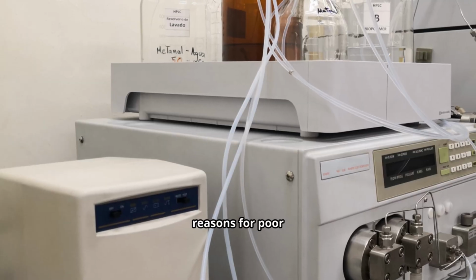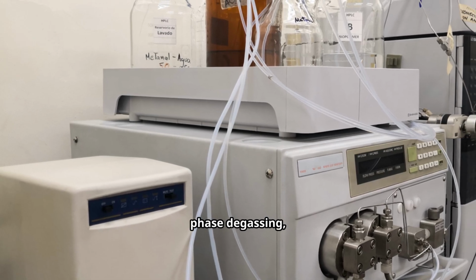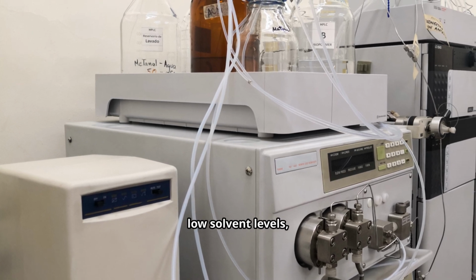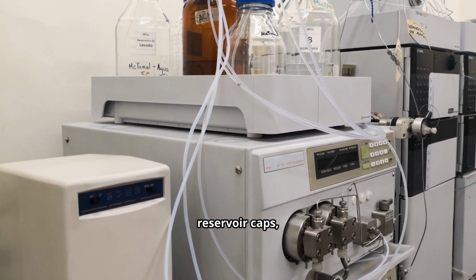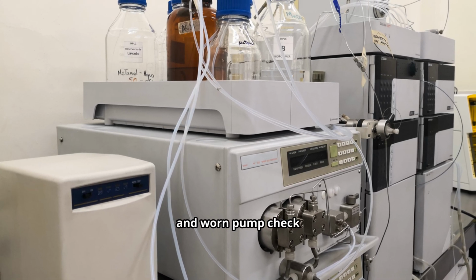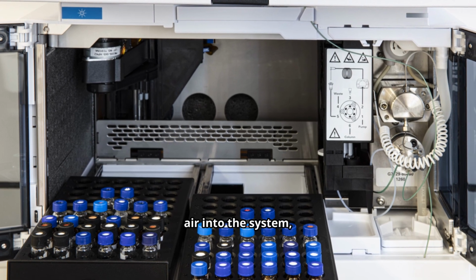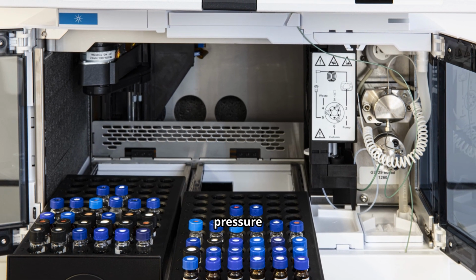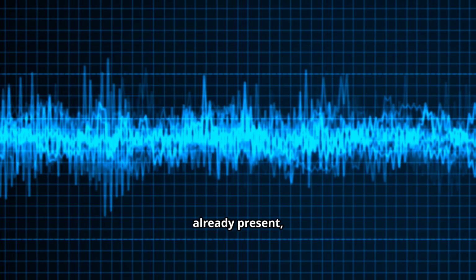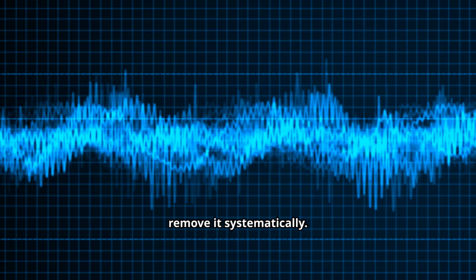The most common reasons for poor degassing-related pressure fluctuations include inadequate mobile phase degassing, a degasser that is not pulling sufficient vacuum, low solvent levels, non-vented reservoir caps, clogged inlet frits, pump inlet cavitation, and worn pump check valves or seals. Any one of these issues can introduce air into the system, and once air enters the pump, pressure instability is almost guaranteed. When pressure fluctuations are already present, the correct response is to assume that air is in the system and remove it systematically.